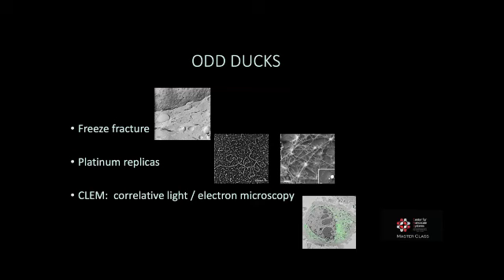There are plenty more sample preparation methodologies that can be used for biologists, although I refer to them as odd ducks, because they're very, very specific applications and are not generally used that much anymore. Freeze fracture, for one, where you freeze your cell, hit it with a knife, crack it open along the planes of least resistance, typically the inside of the membranes. This work was classically done to show nuclear pores, seen here.